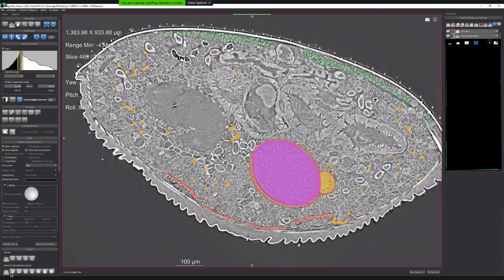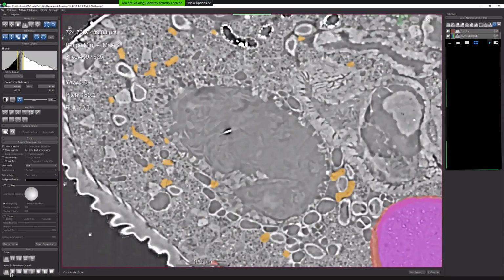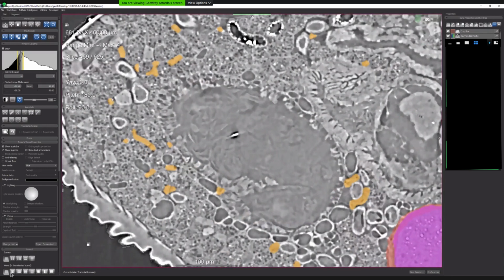Right. So you did try with deep learning. Well, I tried last week. I tried to make an algorithm that would be able to pull these cells out here. These are called oenocytes, but you can see they kind of stand out. You can see one here, one there, one there, one there.